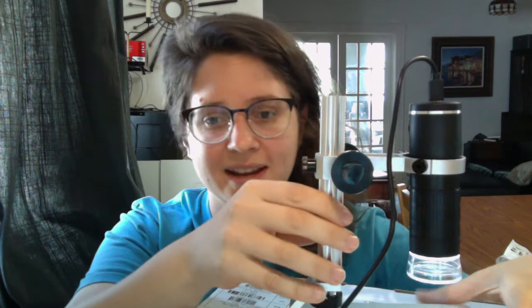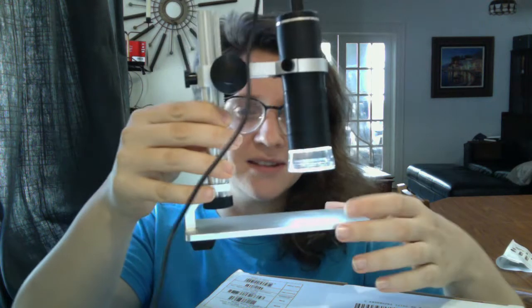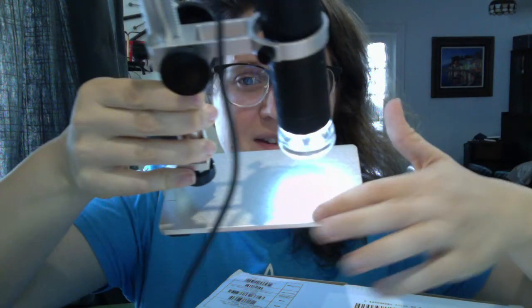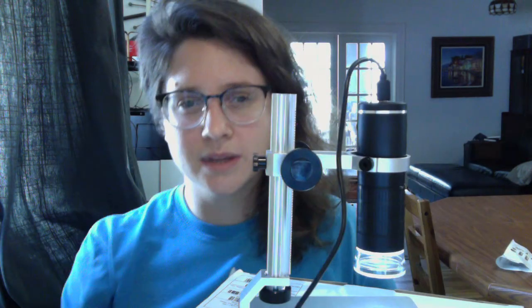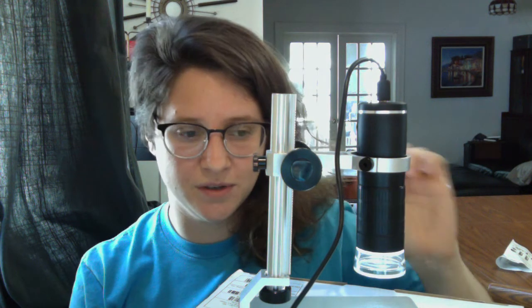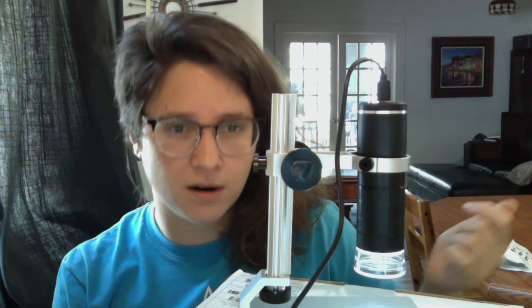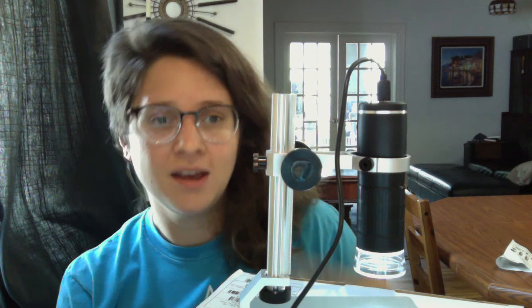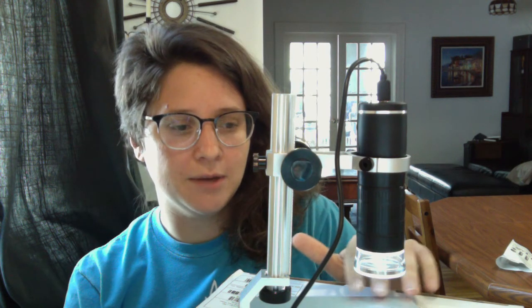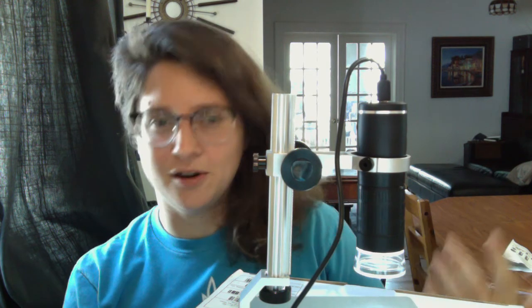A couple of things I don't like about this model: the stage is really small compared to the Celestron — this is much smaller. The other bizarre thing is they use this sort of shiny metal plastic material that is actually really bad for reflecting light. So what you're going to have to do is put some sort of neutral color on here. I used a little bit of white cardstock to basically absorb some light, but because it's white it's a little bit too reflective. If you have a gray sheet of paper, that's probably going to be the best. For whatever reason, the texture they put on this stage isn't all that great.